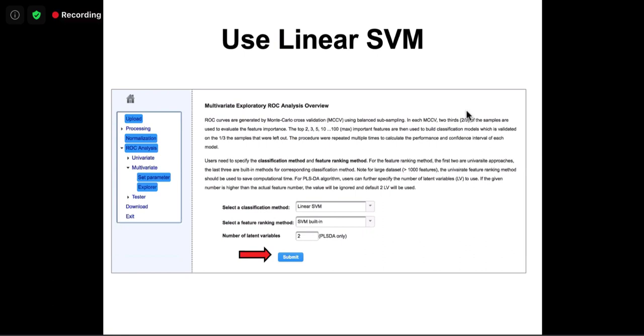Why is that? We want to use a subset of features to build the biomarker models. We don't want to use all features, because the more features you use, the more susceptible to overfitting. If you can find two biomarkers and predict very well, it's much easier to develop in the clinic. So the feature selection and the cross-validation are built in, okay?